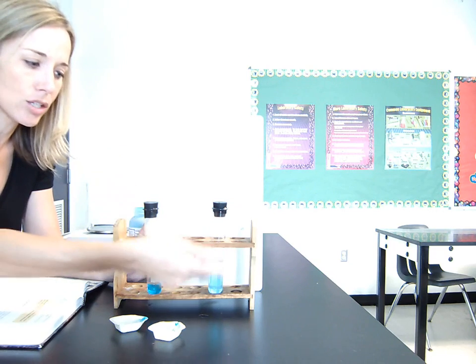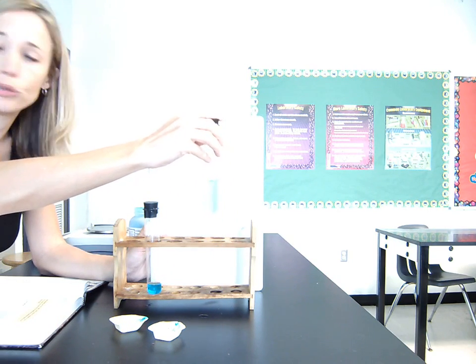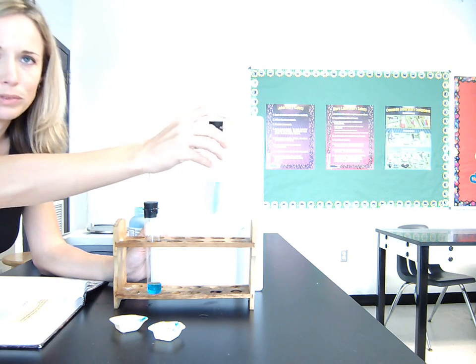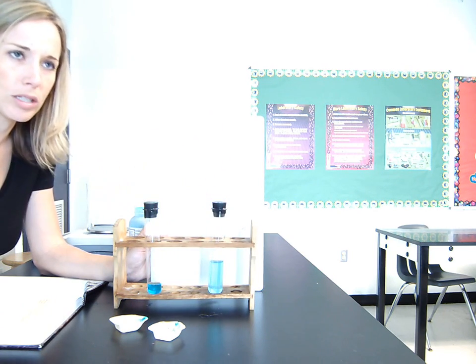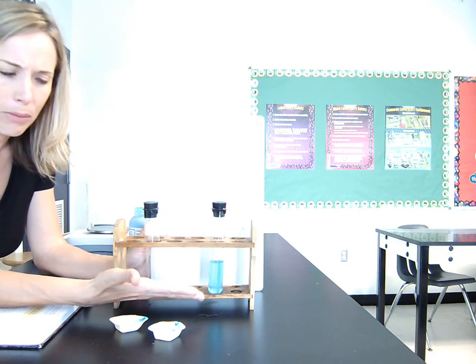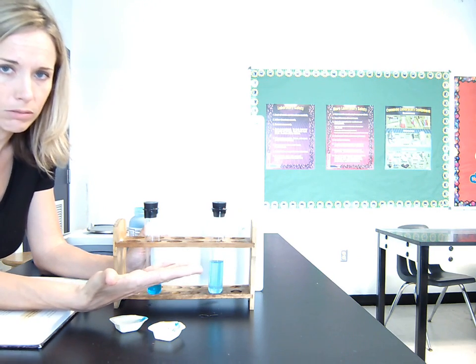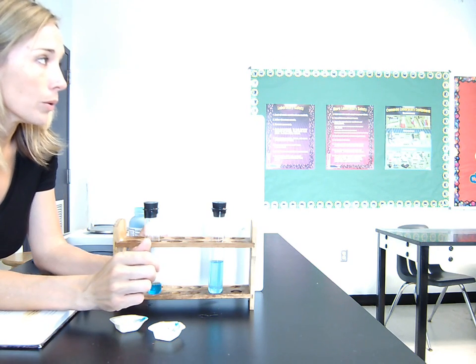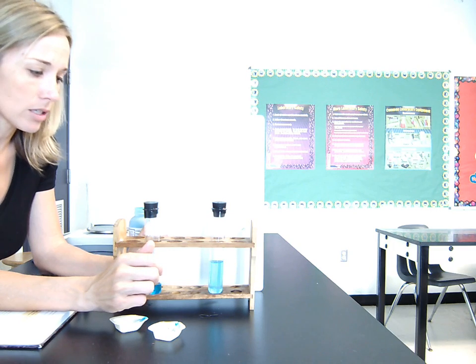The idea is it dissolves uniformly. The word uniform means it dissolves the same throughout the entire solution, which is, you know, part of it's like, well, yeah, of course it does, because we observe this in our everyday life. We just don't actually call attention to it. But it should dissolve evenly throughout the entire solution. It would actually seem very odd for maybe the top half to have more than the bottom half, because why would that happen? Well, the answer is it doesn't happen. So we would expect it to dissolve evenly throughout the entire solution.